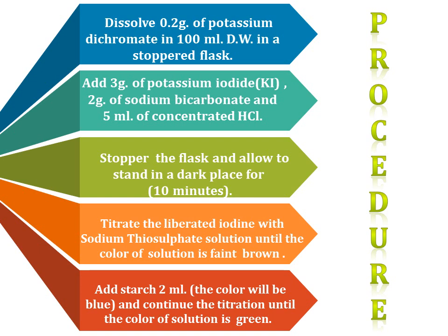After that, titrate the liberated iodine with sodium thiosulfate solution until the color of solution is faint brown.